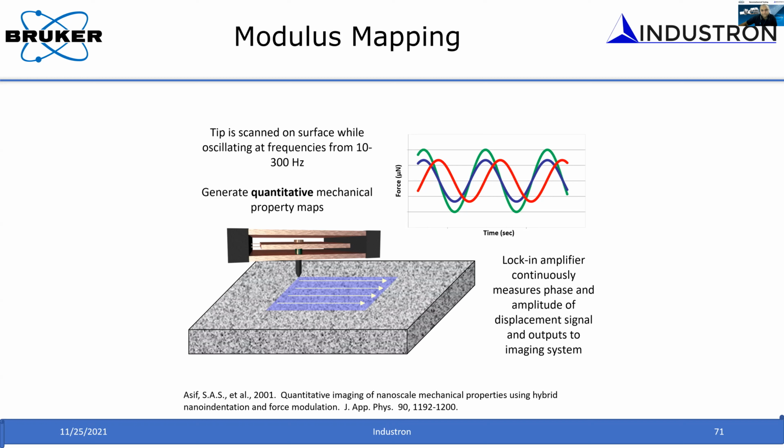That's one way you can quantify it, and it shows the contribution of the second phase with respect to the first phase. If you do a micro indentation technique, maybe you will get the same thing, but it doesn't give you that kind of resolution and clarity compared to doing thousands of nano indentations on the same area.